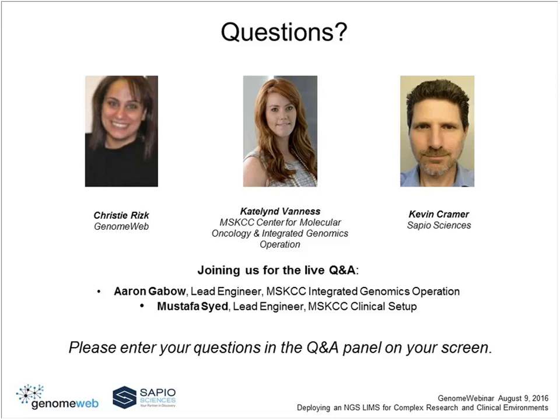Well, we worked on a lot of test data on a development server, and we validated all the workflows. We make sure there are no loopholes and no issues before we release these workflows into production. Another thing associated with production with the clinical system is audits, internal audits, audits of the servers and application, and we went through these two audits also.